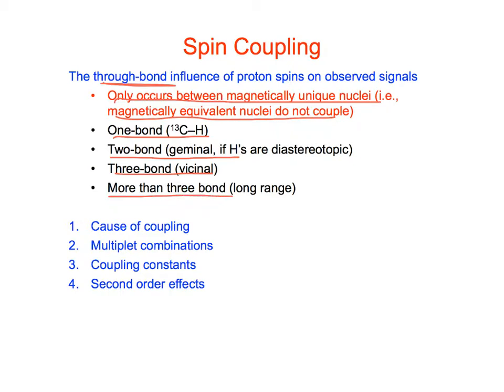So what we're going to do is look at the causes of coupling, look at different combinations of splitting patterns, look at coupling constants, and what are called second order effects.